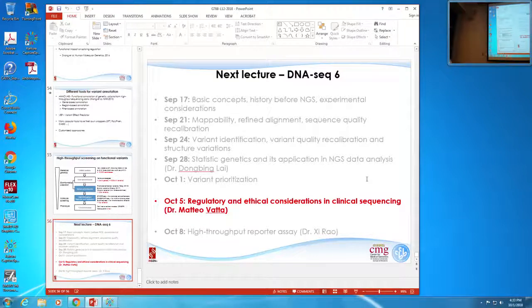For this one, I set up a pipeline for you to run. I ran through a bunch of very simple commands, so you'll see the options on each step. I wouldn't add any additional options, just take a look at what I've done. But while using these tools, look at their capabilities and what other options are available. I made the data set smaller, so the jobs should run within a few hours and you're not waiting around for 2 days for an alignment to complete. I've done what I can to streamline it for you. All the tools in the assignment are available as modules, so you don't have to install anything on your own. That's going to go up right now.